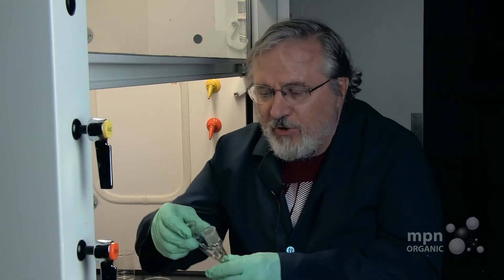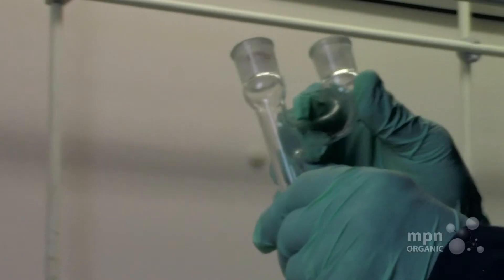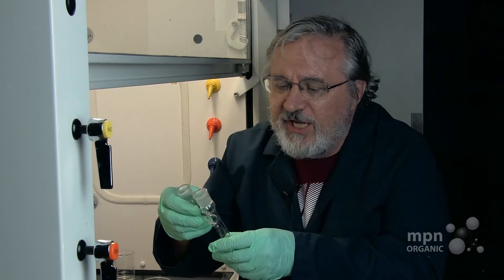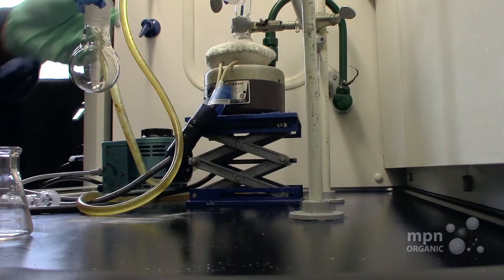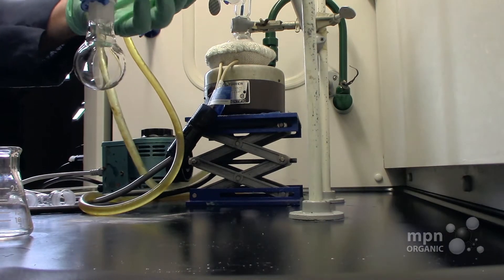As long as we've got the simple distillation set up for you, we can easily interpose another piece of equipment, which is called a Claisen adapter. It's this little U-tube that's found in your equipment, and it's like the three-way, except that it points upward. This is very easy to interpose between these pieces of equipment here.